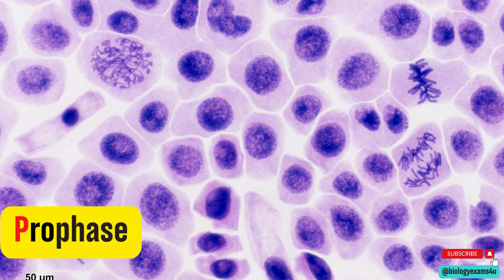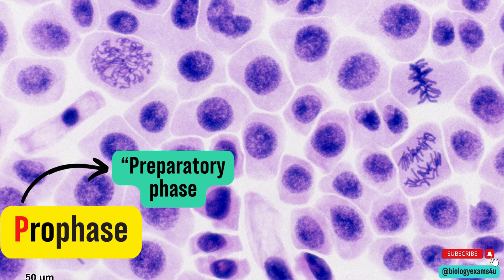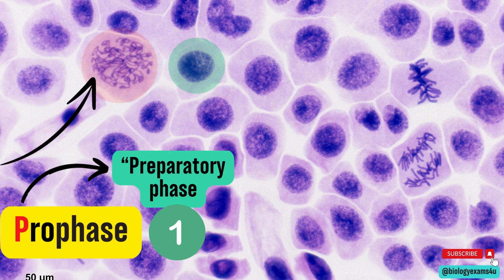Now the first stage — prophase. P stands for prepare or preparation phase for mitosis. In prophase we have to search for chromosomes appearing as a puffy ball of threads within the nucleus. A cell in prophase has condensed chromosomal strands that fill the entire cell. As you see here, this is a cell in prophase. But in the cell at interphase the chromosomal strands are not condensed — the individual strands are not visible, and the cell is often small compared to the cell at prophase. So in this field there is only one cell in prophase.